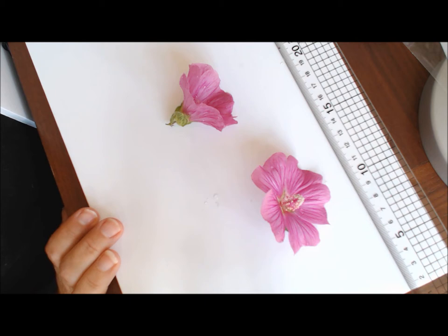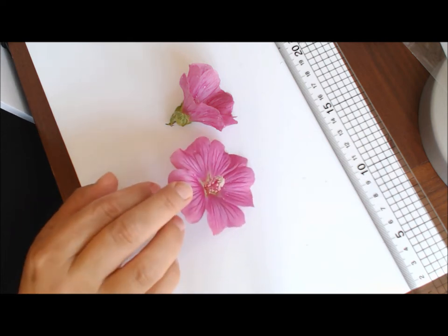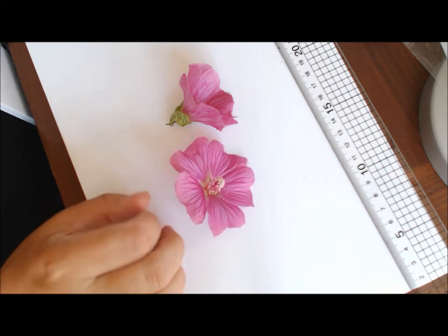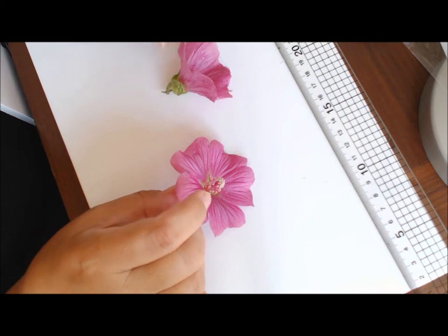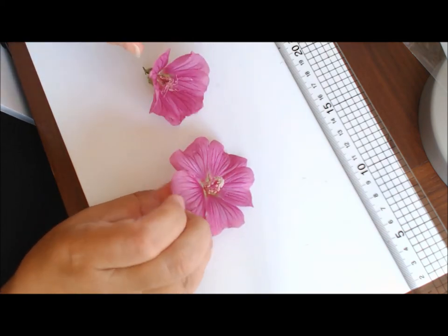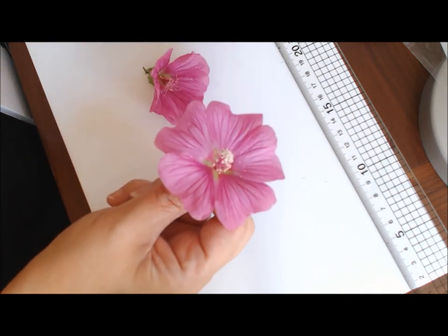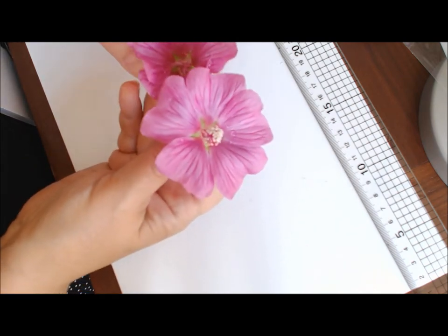I'm going to run through a dissection today for you, and I've chosen this Lavatera flower which I've just cut from the stem. They're fairly freshly opened flowers. You should always investigate the stages of your flowers before you start. You can see this one's a more recently opened flower than this one.